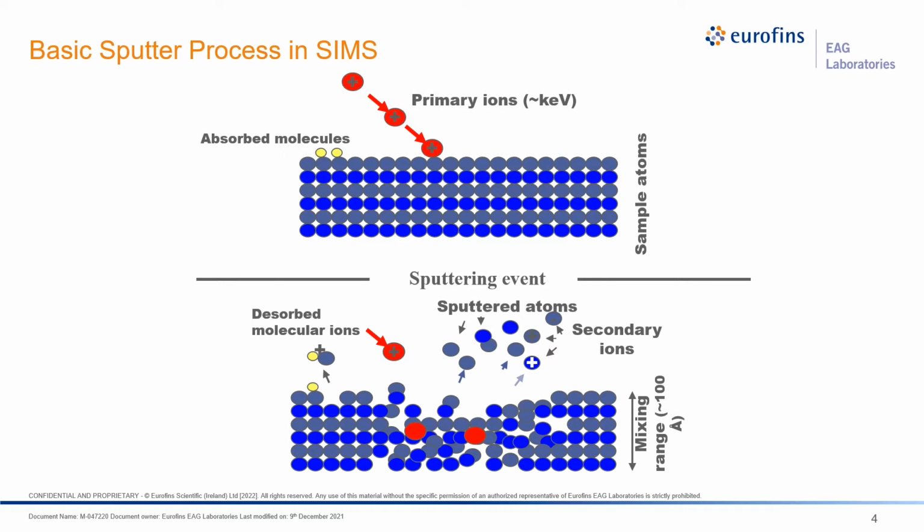The trouble is that you need to find a balance between getting a good depth resolution, getting the analysis done in an effective manner, or getting the detection limit you desire. They all work against each other. So you have to design the SIMS instrumentation or measurements based on the specific goal.